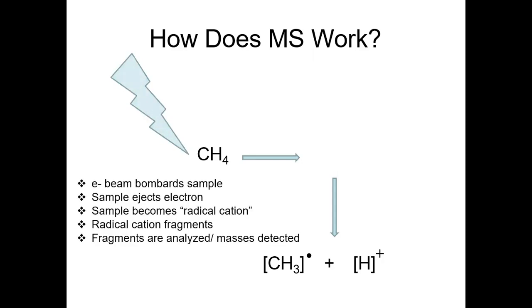Right? So this is just an overview of what I just said. The electron beam bombards your sample. The sample ejects an electron.